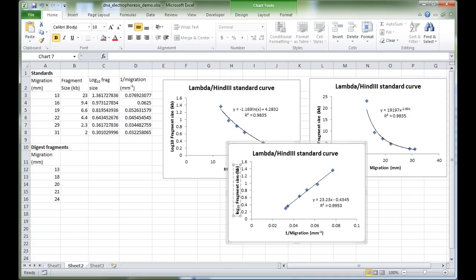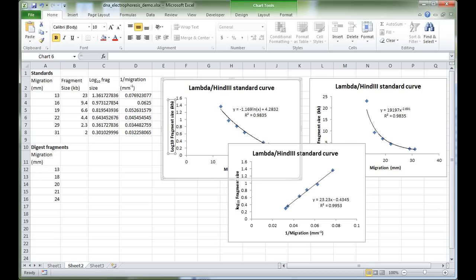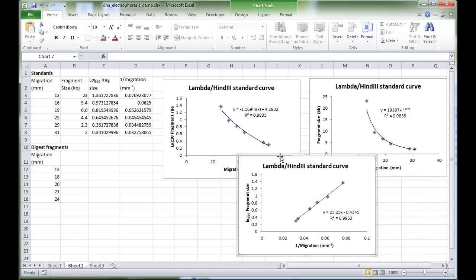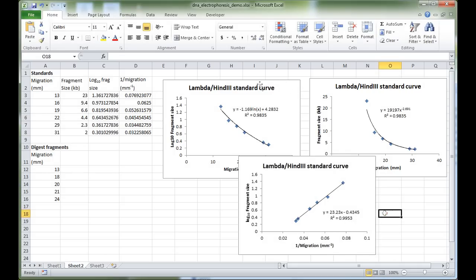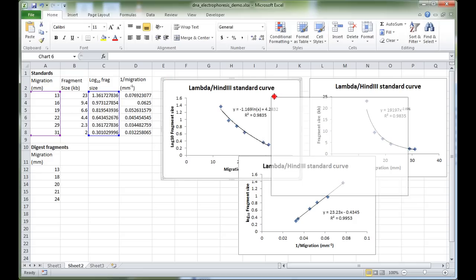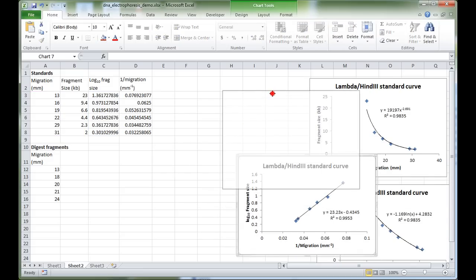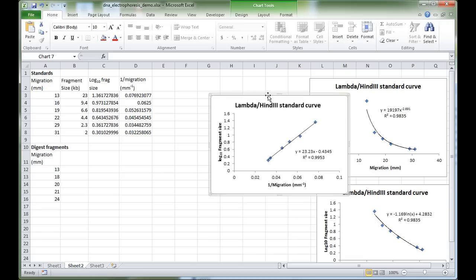This third standard curve is very nice because it relates in a linear fashion the y (log fragment size) to the x (1/migration). We always want to use Excel to work out the mathematics for us, so we can get Excel to output the slope and intercept of our line. Let's type 'slope' and 'intercept' as labels.